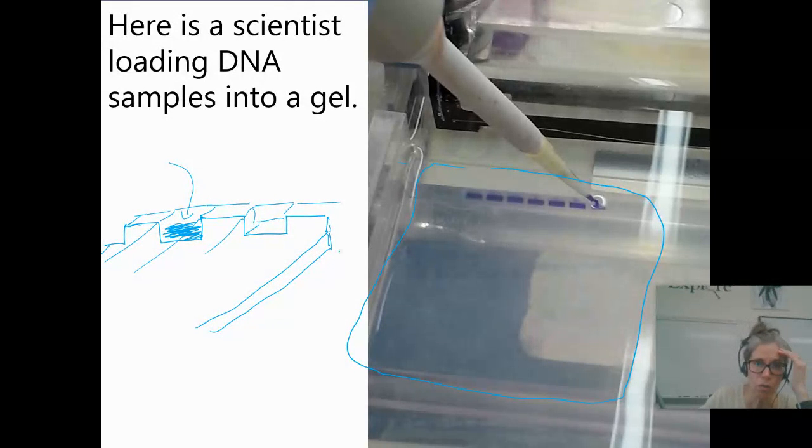So the holes don't go all the way through. The very bottom of the gel is here. You want to put your sample into this space right in here. It's a little depression, not a hole all the way through to the bottom, and it's made by sample combs.